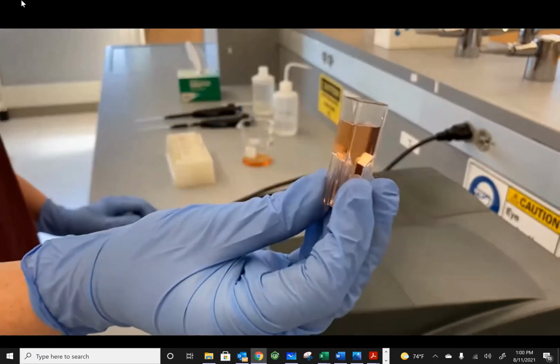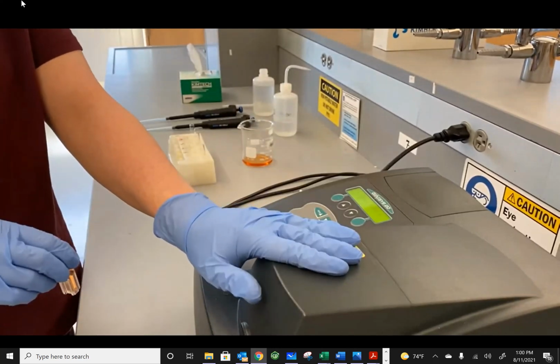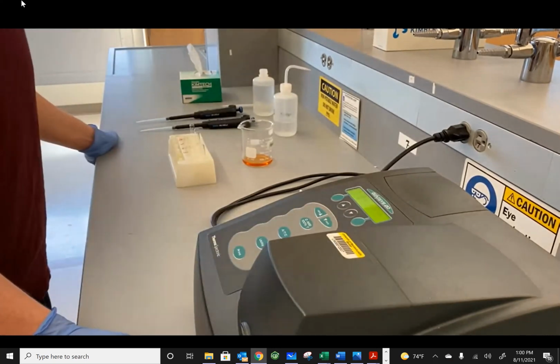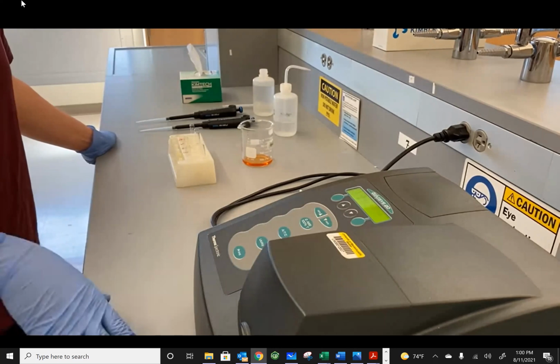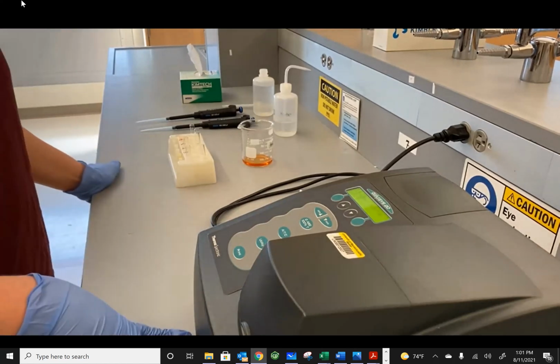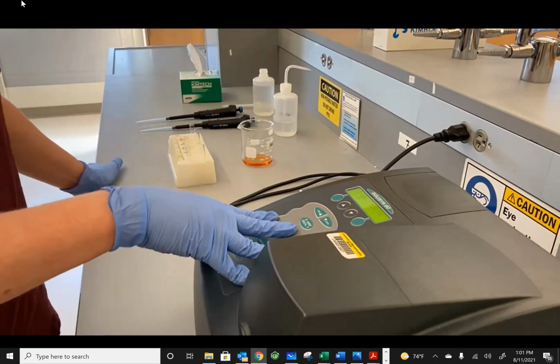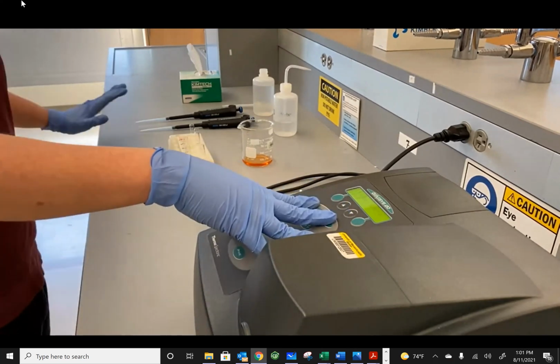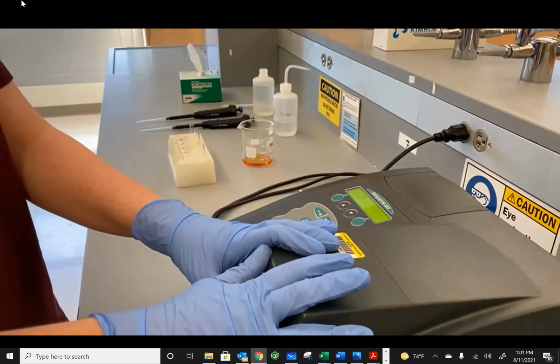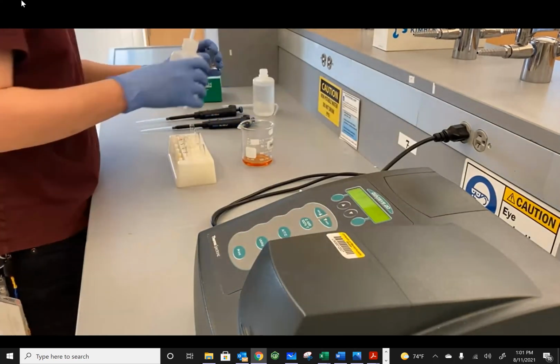As you can see, it is a slightly red color, it has a slight tinge to it, and it is already deposited into the cuvette. We make sure the spectrophotometer is set to the right wavelength, it is blanked before we do our measurement, and we take our standard and put it into the machine. Most of you, if not all of you, should have experience with doing Beer's law measurements before, so this should be relatively familiar to you. The absorbance that we get here, we will send to you in a data sheet for you to work with, as well as all of the absorbances we get for the following trials. With the standard measured, you would make sure the machine's closed, you get the reading, you record it, and you set up for the first trial. Now make sure you clean your cuvette.